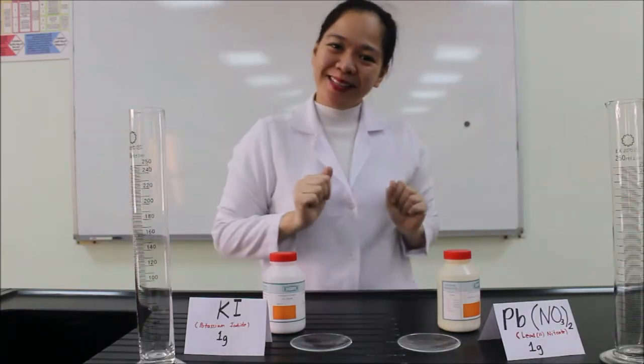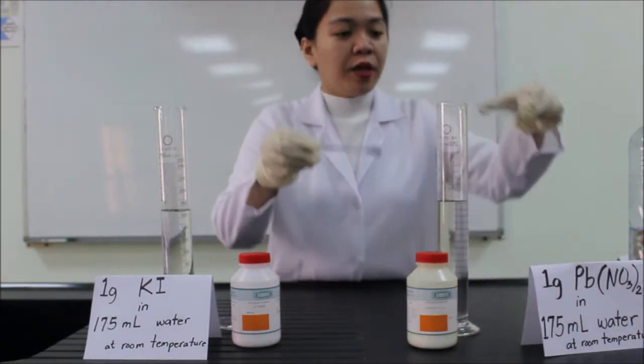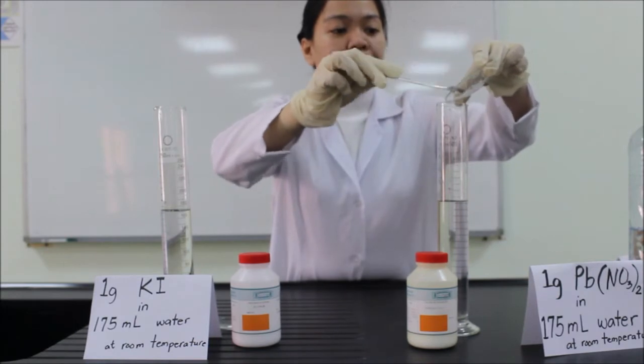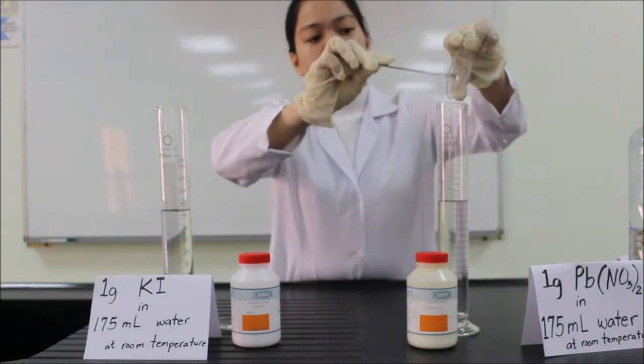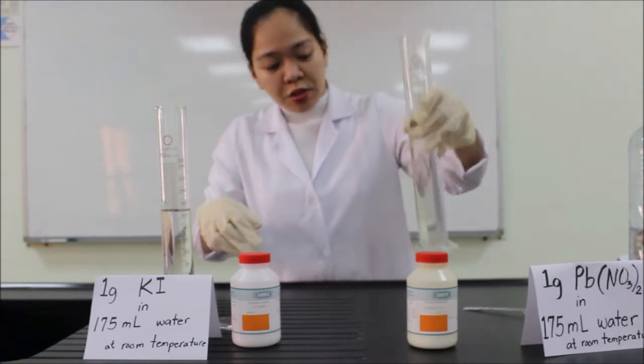Let's begin. Now I will put the 1 gram of lead nitrate in the 175 ml water. Wait until it is thoroughly dissolved.